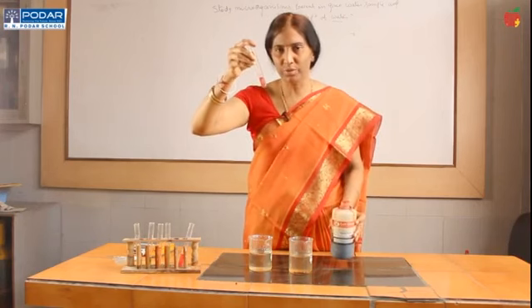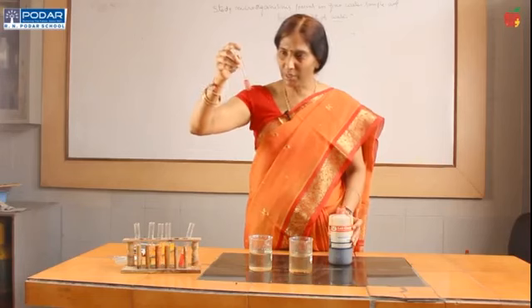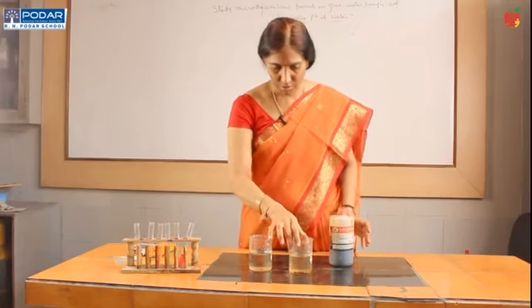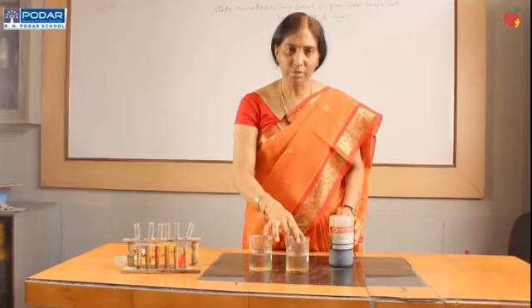So, this is not suitable for aquatic plants and for us also, and this water might also contain many microorganisms, which we are going to prove. We are going to take 1 drop of this pond water on a clean slide and observe under the microscope. If at all any microorganisms are there, let us find out.